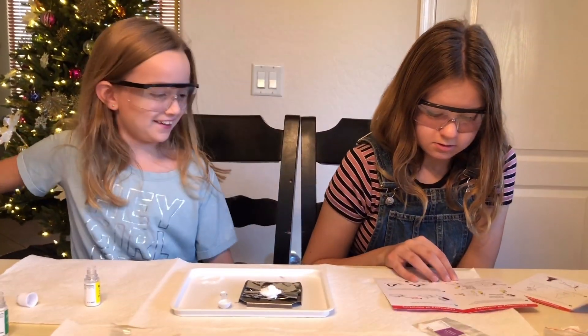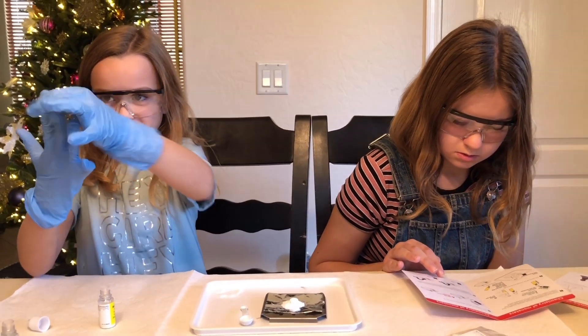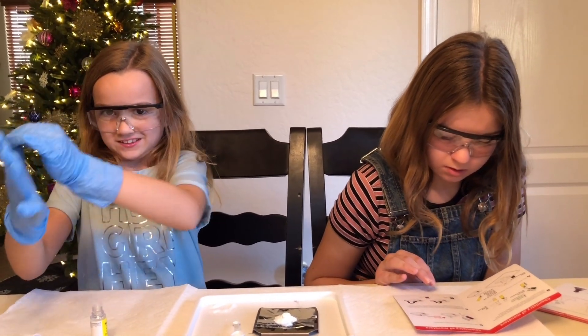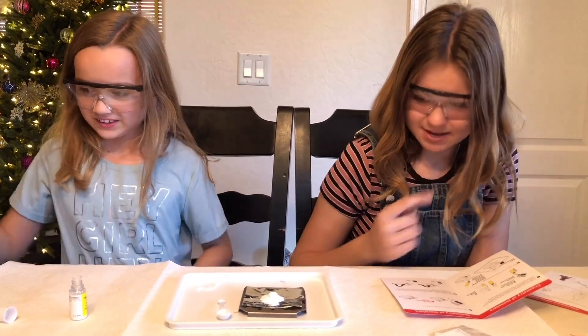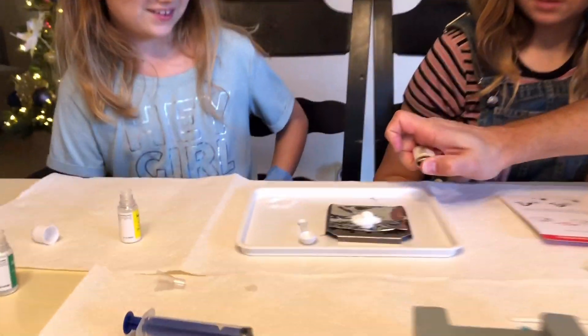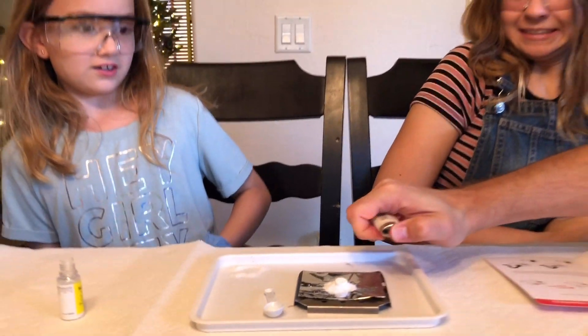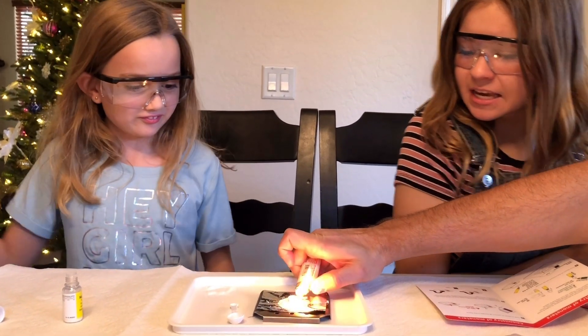Now we've got to take off our gloves because we're working with fire. Come on top - now it's time for it to be heated. You've got to catch it on fire - you just heat the tablet thing up. There it goes, it's lighting on fire! Let's light this other side up too.